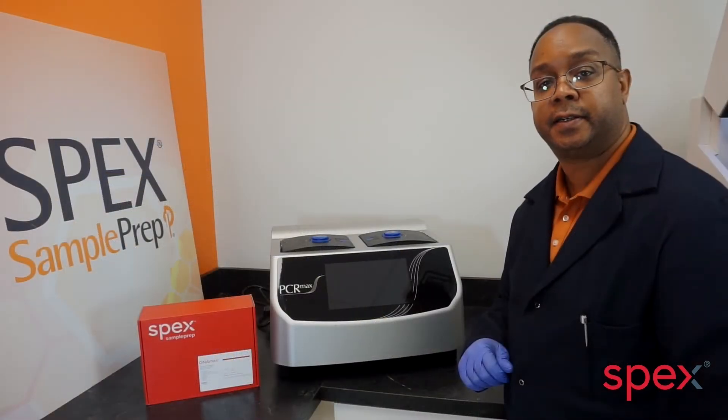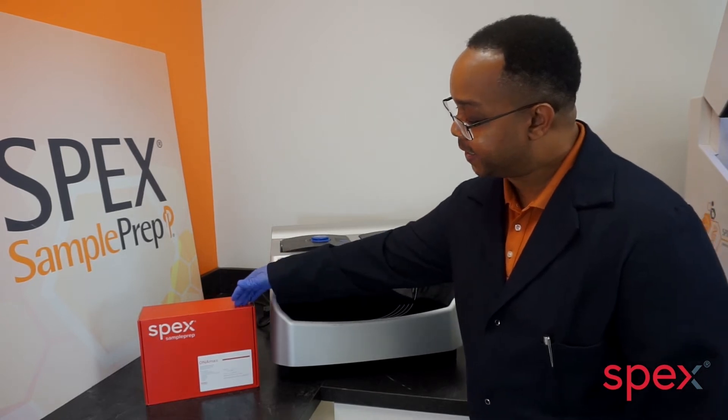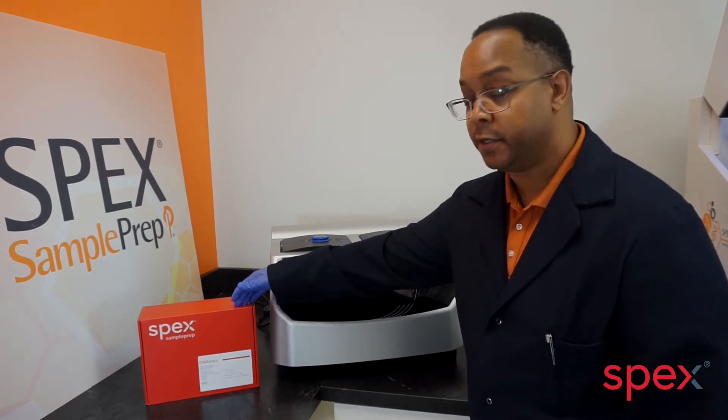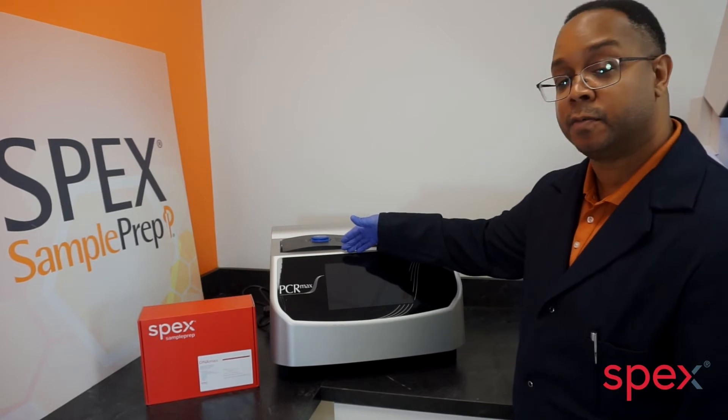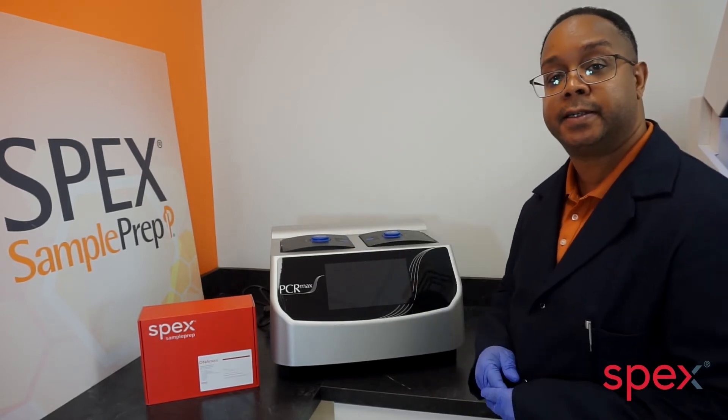For sample preparation that requires DNA extraction, the new DNA Max kit can be used in combination with the PCR Max thermocycler to obtain high-purity DNA.